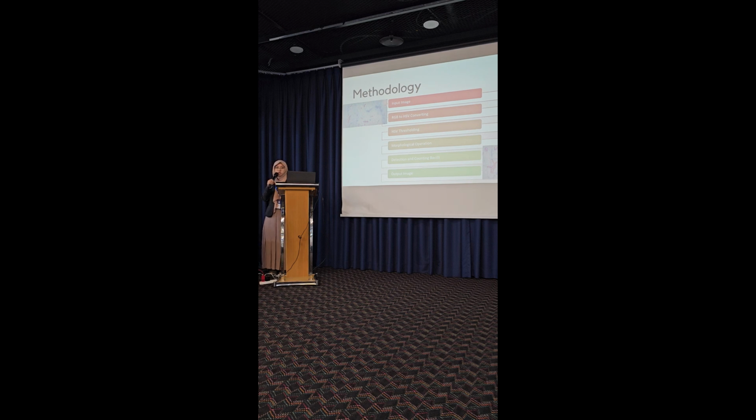And then this is the methodology. This is the input image, and then we go to RGB to hue, saturation, and value converting, and then we go to HSV thresholding. After that, we improve the image by morphological operation, and then I do detection and counting of bacilli using edge detection, and I also add a rectangular object to count how many bacteria are displayed in this image. So this is the output image that we can see.